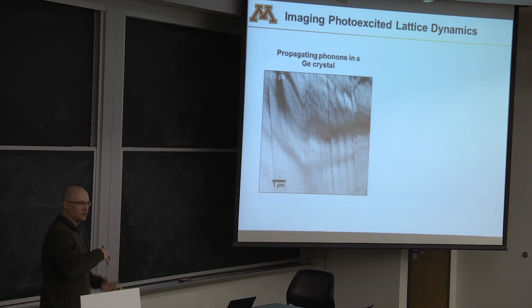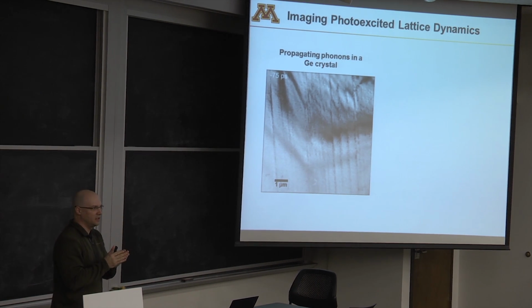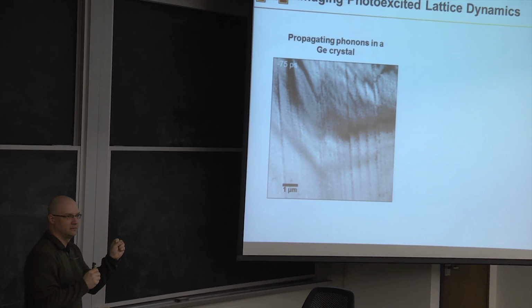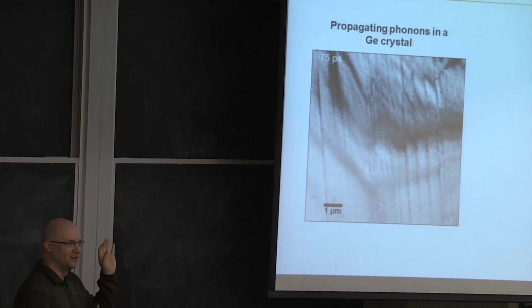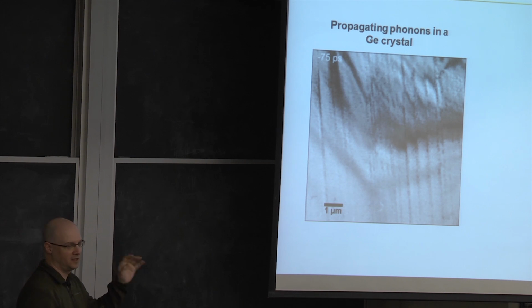So I'm going to play the video. This is an ultrafast electron microscope video. Our shutter, our time resolution here is about a picosecond, okay? So before we could do a millisecond, right? So it's better. All right, and what you're gonna see is I have a little timestamp up at the top here. This says minus 75 PS.